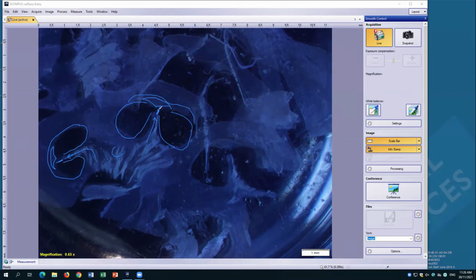So now this is taken from the same cochlea, but it looks totally different because it's taken from a different location. So again, what you can see is completely different. And the difficulty often is having a comparative location to compare from one data set to another. If we want to see any changes with pathology or individual variation, we have to first find a comparative plane to compare out of this 3D structure, because depending on the angle and location you're looking at, what you can see and visualize is completely different.